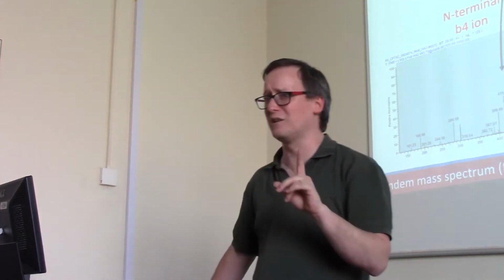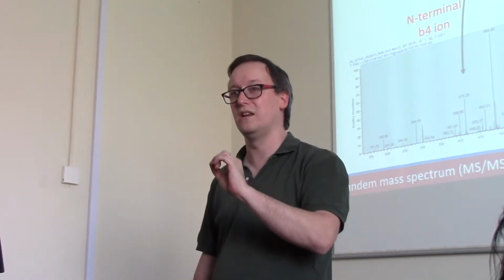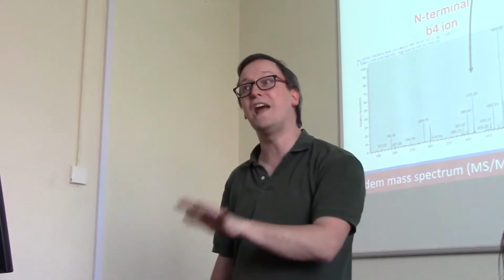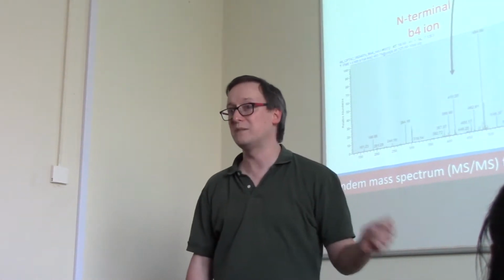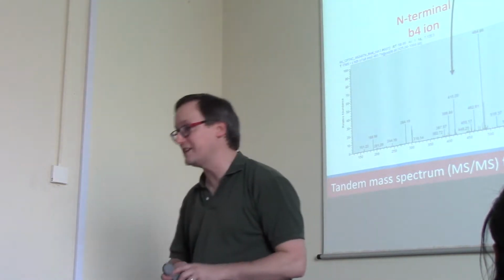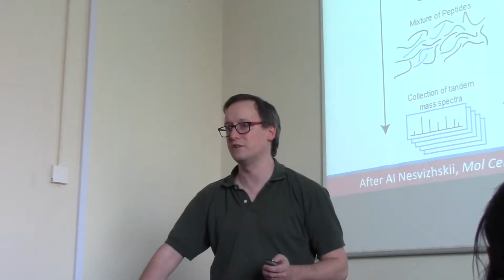Now, I said that a particular way. I feel pretty comfortable about my ability to say this sequence is or is not this spectrum. But I find it a lot harder to look at this spectrum and just read the sequence off of that. I spent a whole semester in a course that attempted to do just that, and I have to say, it's really hard. So we would like to have some software to help us with that. In fact, we'll take a whole suite of software to do that.